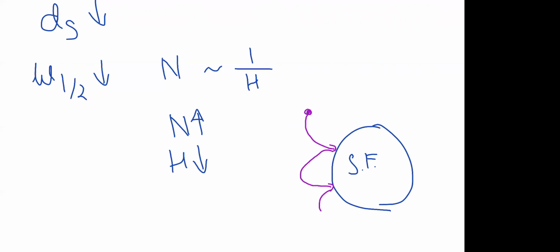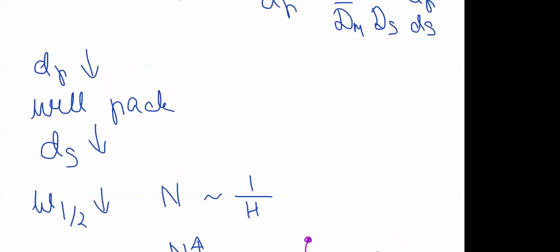So if I'm here having retention events when the molecule is being retained and then again released from the stationary phase, then the theoretical plate height can be viewed as this distance between these two events. So the distance the compound travels in the column between two retention events. And we want it to be as low as possible to keep our peaks very narrow.